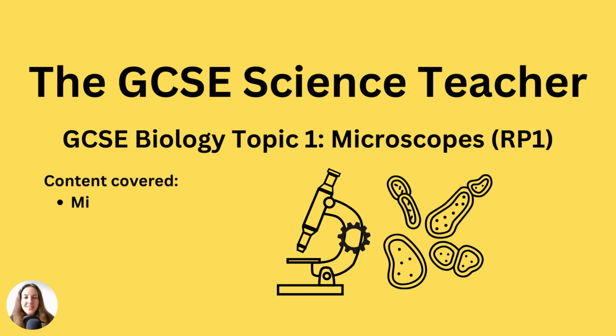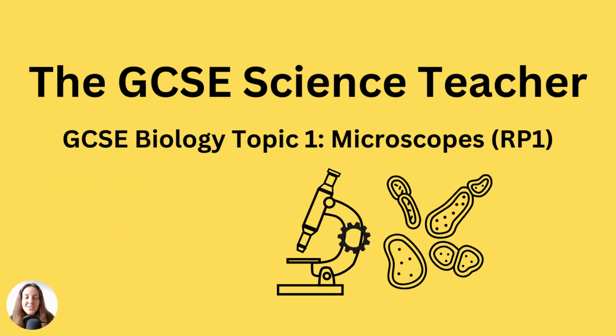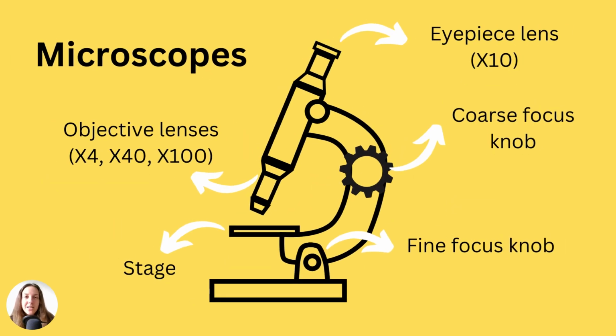I'm the GCSE science teacher, and in today's lesson, we'll be learning about microscopes for the GCSE Biology course. Content covered today includes microscopes, required practical method, and microscope calculations. Let's get started. So, what actually is a microscope?